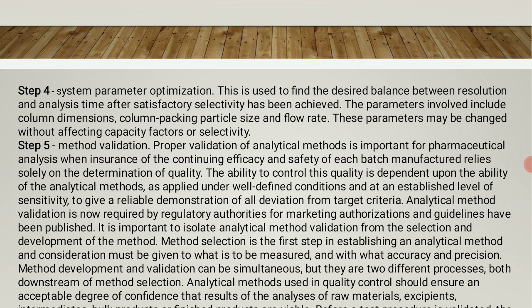Proper validation of an analytical method is important for pharmaceutical analysis. The assurance of the continuing efficiency, efficacy and safety of each batch manufactured relies solely on the determination of quality.